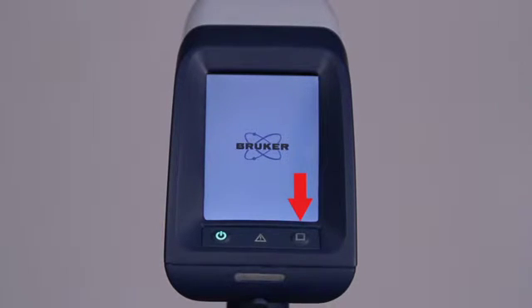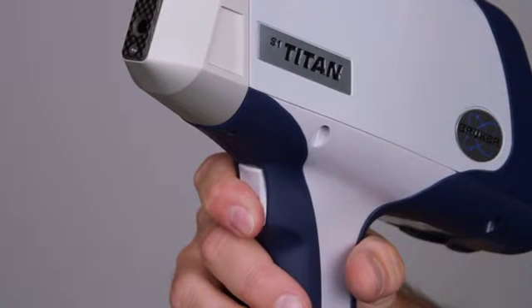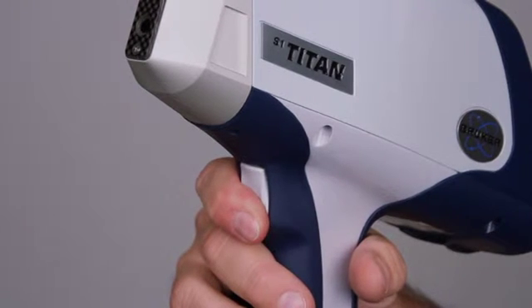The right button is for analyzers configured with an optional auxiliary trigger. The middle LED is for the IR proximity sensor. This LED lights up when an object is within range of the examination window. X-rays cannot be generated if the sensor is not detecting an object. The operator trigger is used to start and stop measurements. Note that all safety features must be met in order for the trigger to initiate the generation of X-rays.